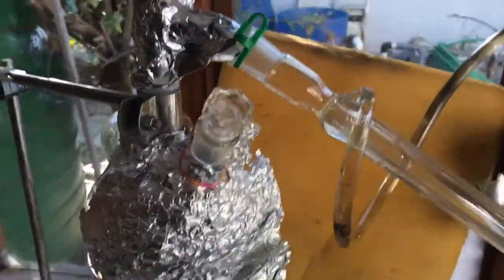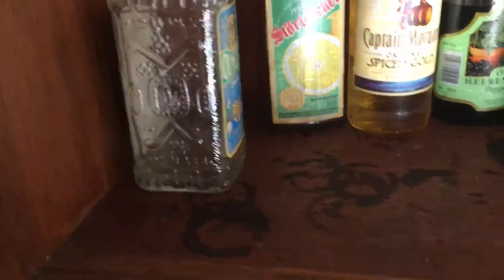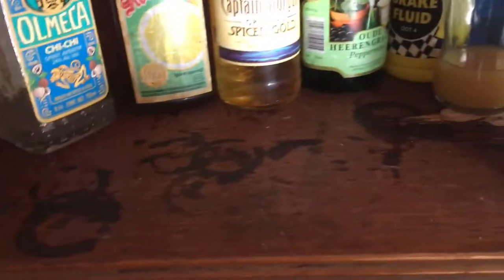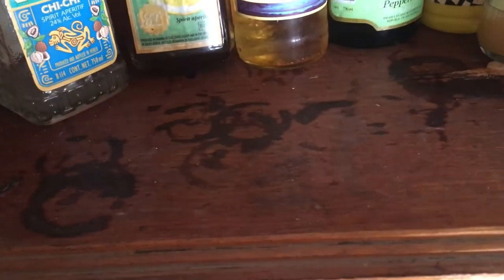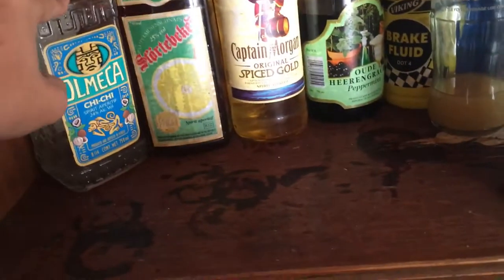So basically, I'm distilling ethanol — yay ethanol — from this alcohol. Right now I'm distilling this stuff. All of this alcohol is undrinkable because it's really old, and because the seals are all broken. This stuff is 25%, this stuff is 25%, this stuff is 37%, this stuff is 25%, this is 24%.